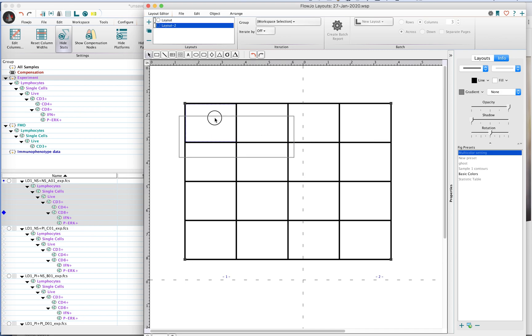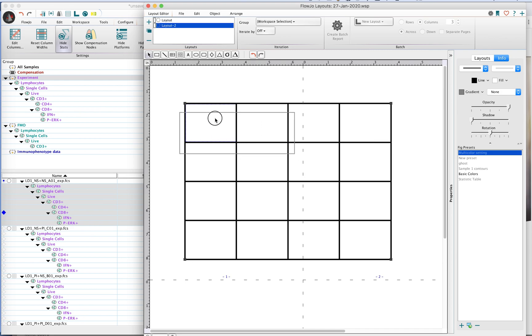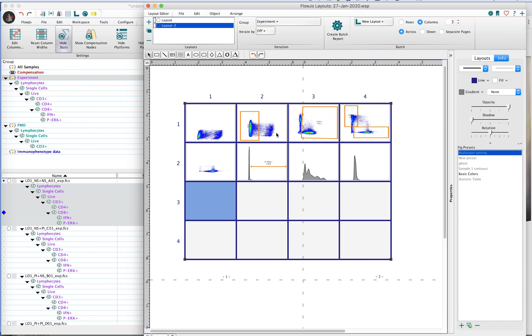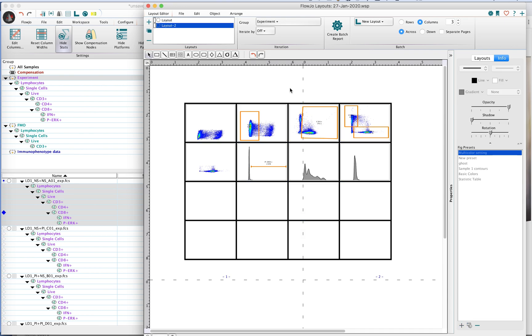I recommend that you target the upper left quadrant or the upper left square, and then that way all of the other squares will get filled in. Your plots will come in here all arranged and aligned so that it's easy to manage.